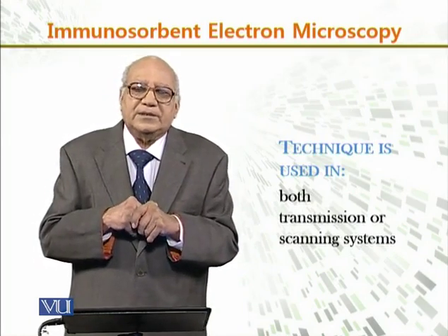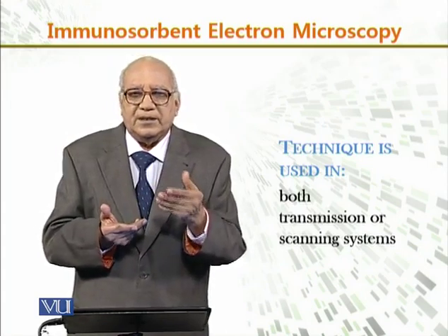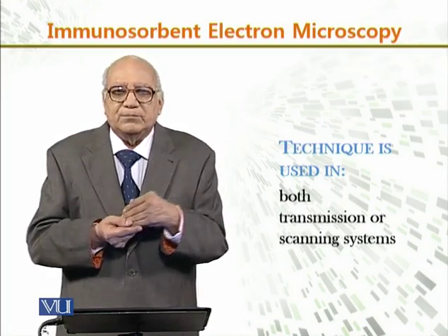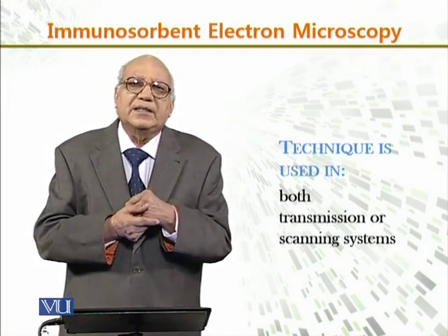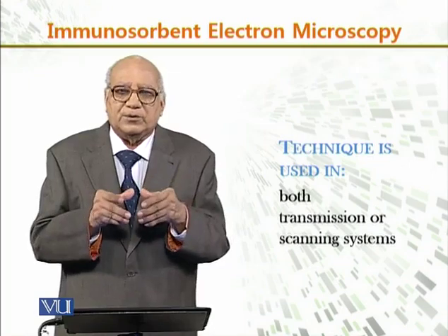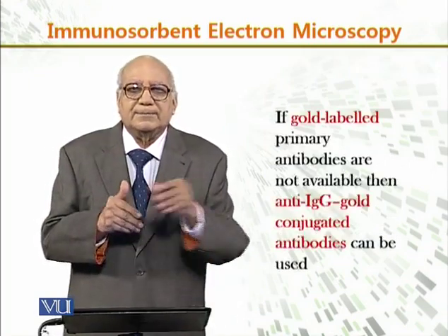Now, the technique is used in both transmission and scanning systems, that is, we can use it in a transmission electron microscope or a scanning electron microscope. Both microscopes or both techniques can be used for this.